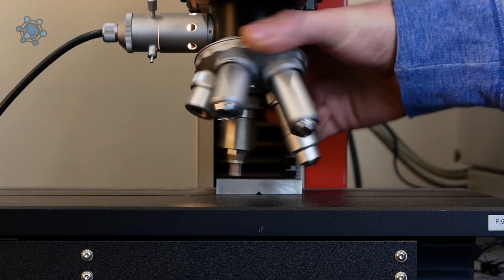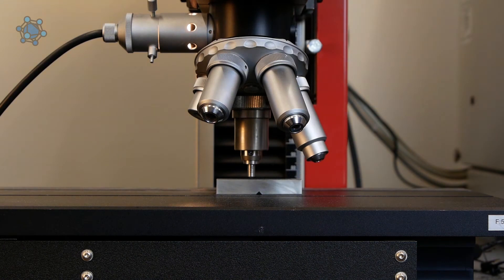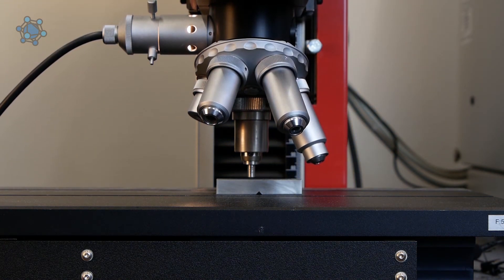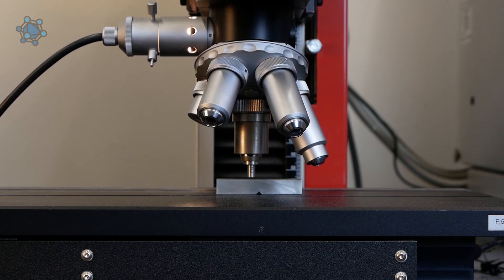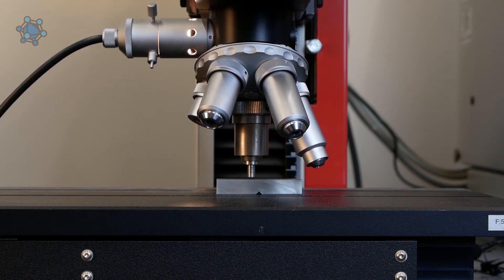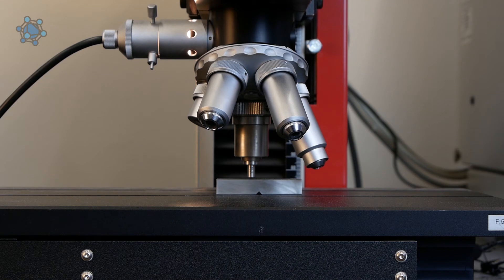The test head must be swiveled forward by the tester so that the test can begin by pressing the start button. The pyramid then moves in the direction of the workpiece and the test force increases uniformly up to the set value.